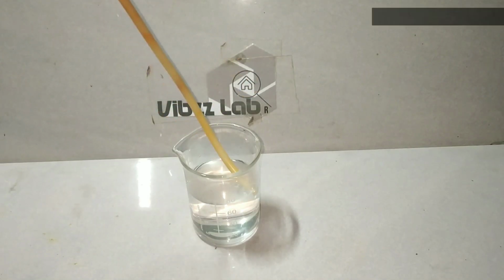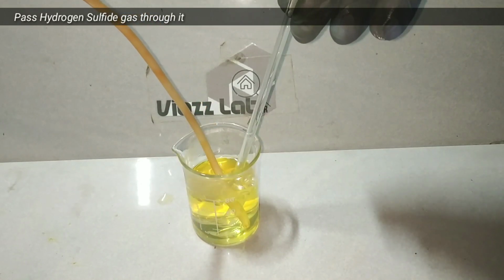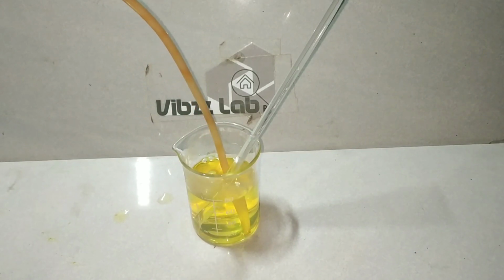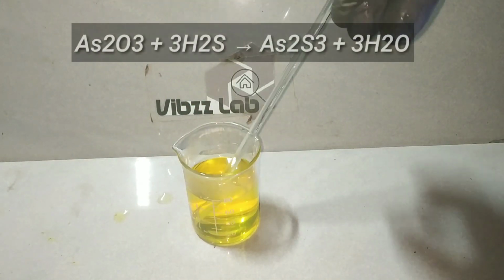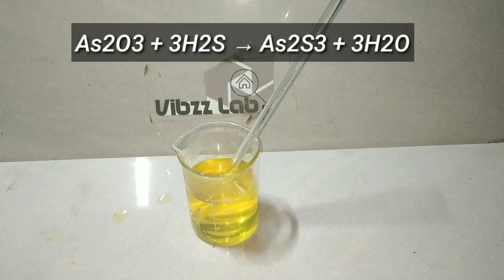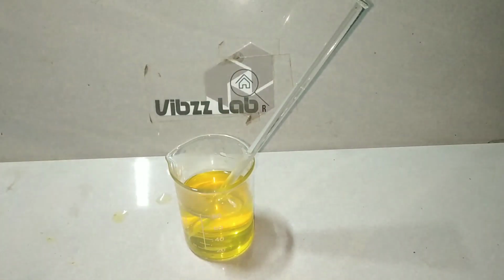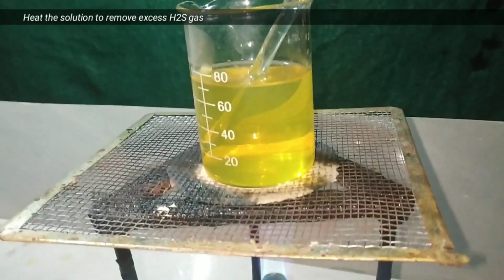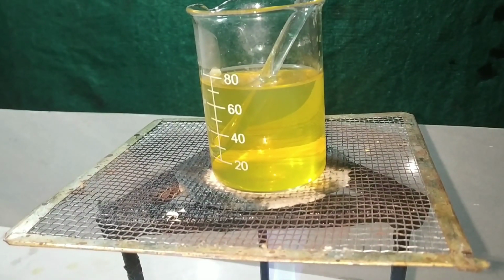After filtering the solution, we will pass hydrogen sulfide gas through the solution. You can immediately see that the solution is turning yellow. In between the addition of hydrogen sulfide, use the glass stirring rod to mix it up well. What's happening here is arsenic trioxide reacts with hydrogen sulfide forming arsenic trisulfide. And here we have the sol of arsenic trisulfide. Now we will heat the solution to remove excess hydrogen sulfide gas dissolved in the water.